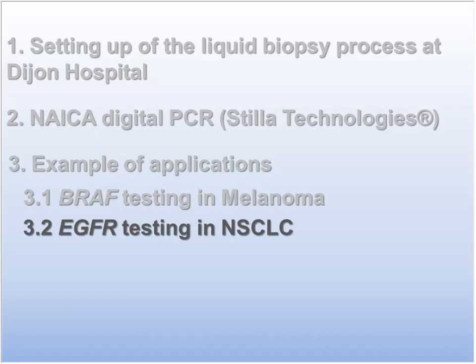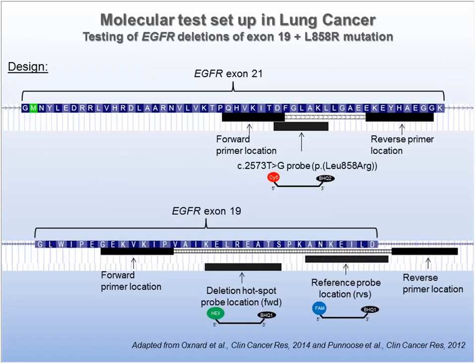Finally, I will finish my presentation by showing you the EGFR testing in lung cancer. So here is an example of a design that we use for lung cancer.